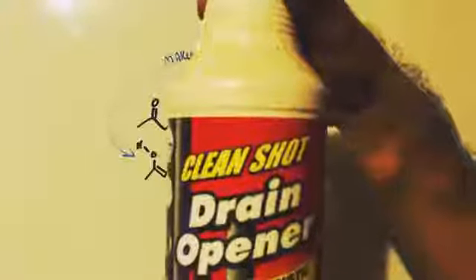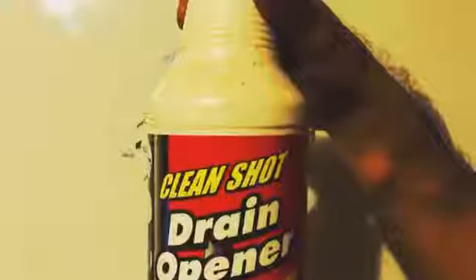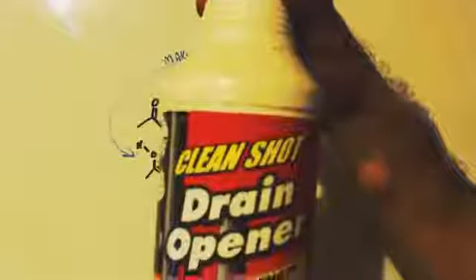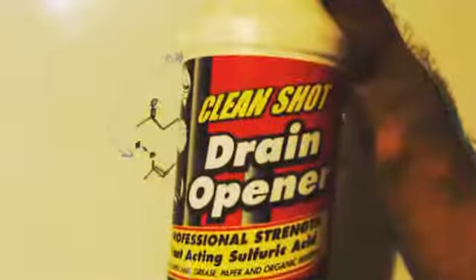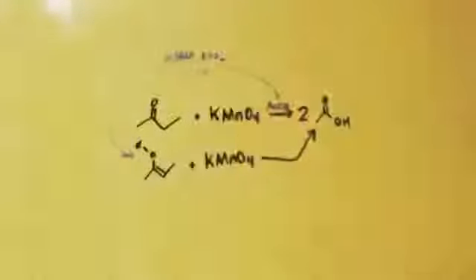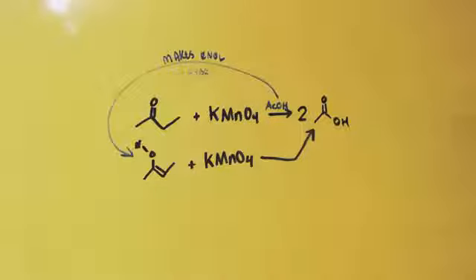And if you pour the acid into the peroxide, you're going to have more peroxide, like 99% peroxide and 1% acid, then you're going to end up blowing yourself up. So always remember that. Peroxides go into acids, acids go into other stuff. So if you don't know what you're doing, I suggest you do not mix sulfuric acid and hydrogen peroxide together. And if you do, you find out the correct ratios that you need. If you don't know what you're doing, don't do it.